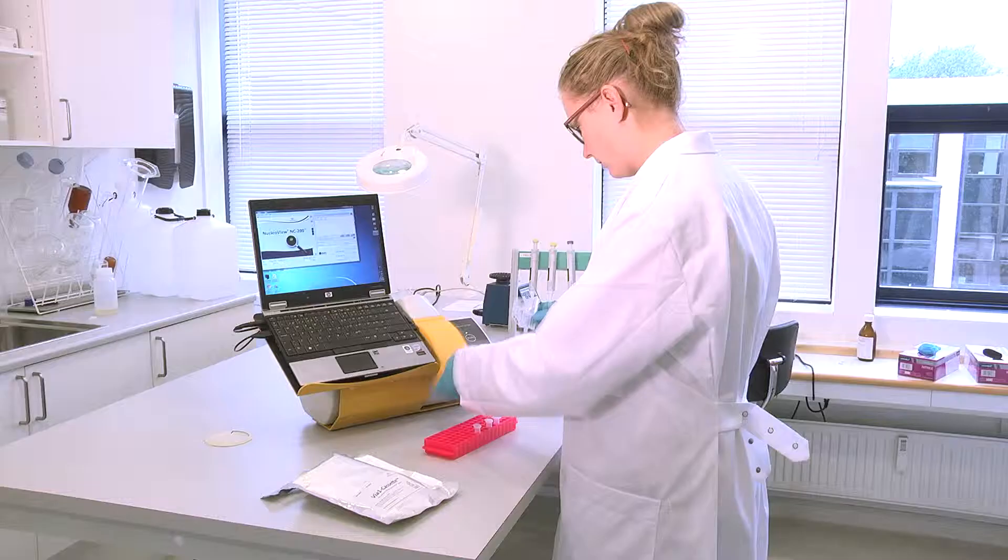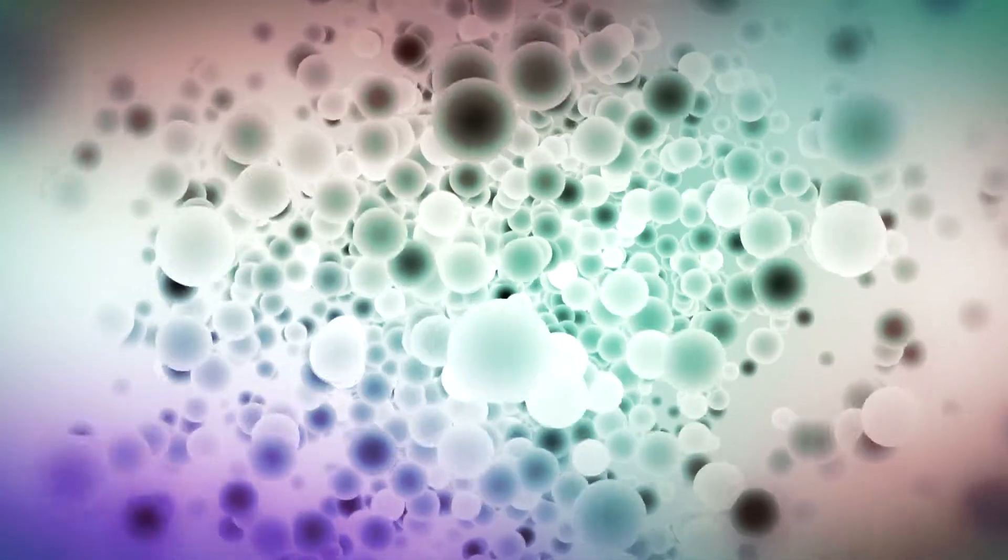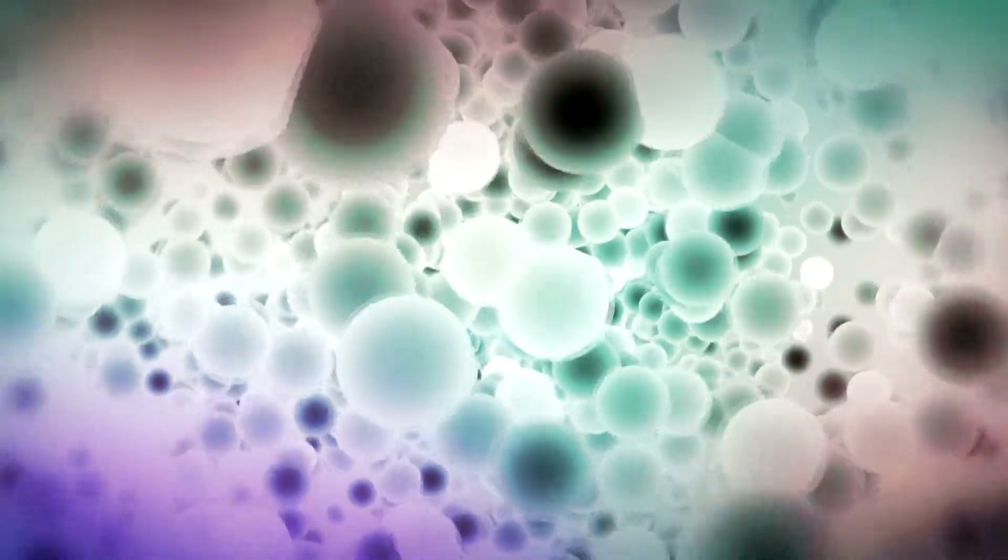The Nuclear Counter NC200 offers automated cell counting, optimized for several different cell types, including stem cells and adipose-derived mesenchymal stem cells, often used in regenerative medicine.